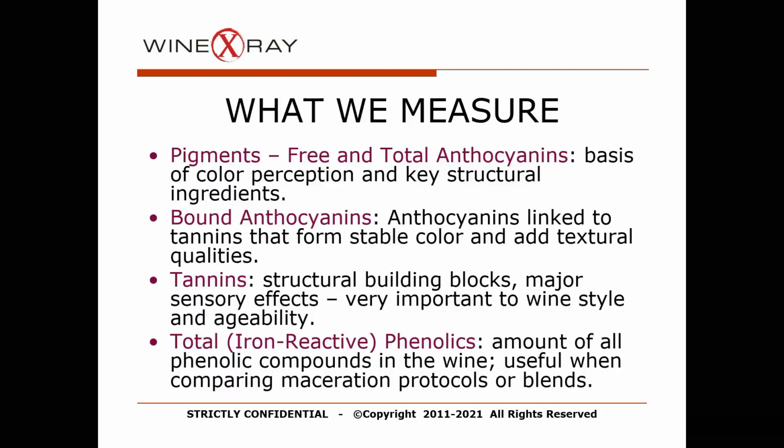So we measure, and this comes from the Harbertson-Adams assay, our colored forms, our pigments: free and total anthocyanins. Anthocyanins is a group. We're not measuring just malvidin-3-glucoside, because there are 15 to 20 different anthocyanins in vinifera, with different ratios and different amounts. Varieties are higher in one than another. For example, Cabernet is very high in malvidin-3-glucoside. The free anthocyanin is the available amount of color in your must at your wine pH. The total anthocyanin is pushed to a pH of 1.8, where all of the flavylium cation is lit up, so it gives you a reference point about what has more color on the same relative basis. Total anthocyanins is a great value when you're looking at the total amount of color. It's not at your wine pH, but it tells you what is in the matrix.